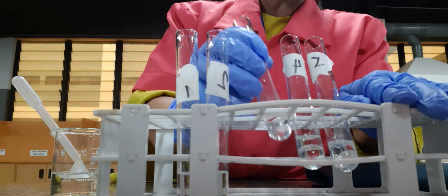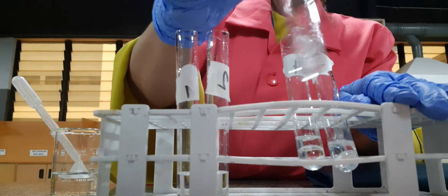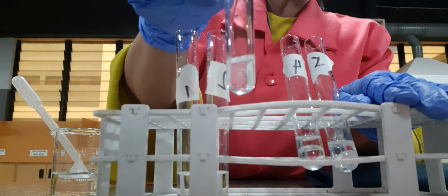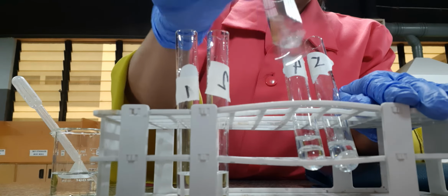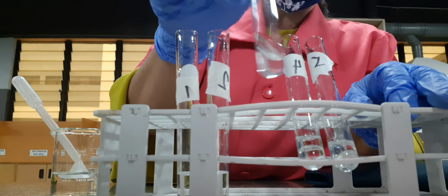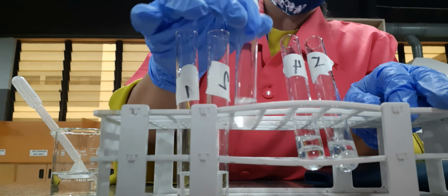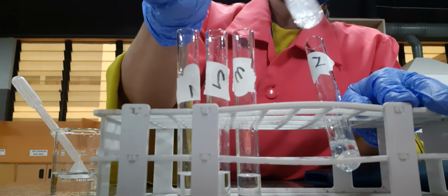Now we have the acetone. Just the same, try to look at that. So acetone also dissolved in water, or is miscible in water. And then we have benzaldehyde.